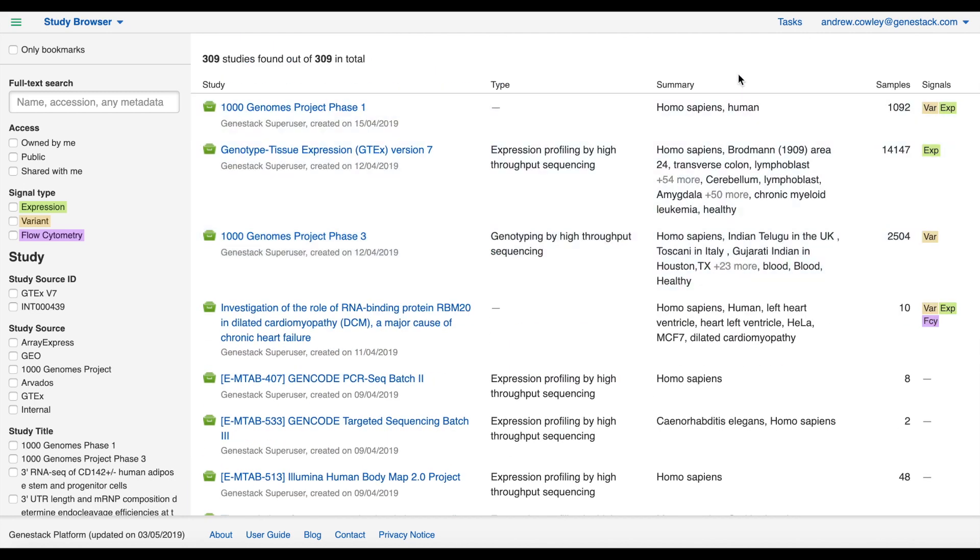The third column is a summary of the metadata that is associated with a study. This displays information such as the organism, tissue, cell type, disease, and so on, and is pulled straight from the metadata fields of the samples in the study.